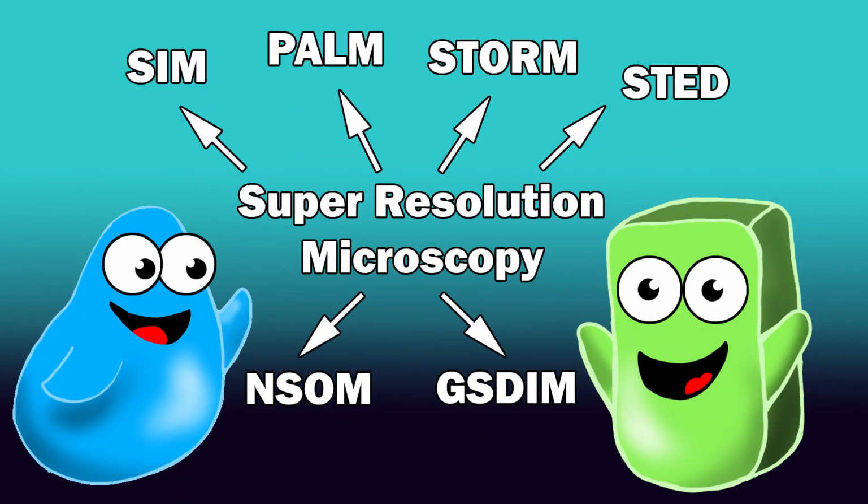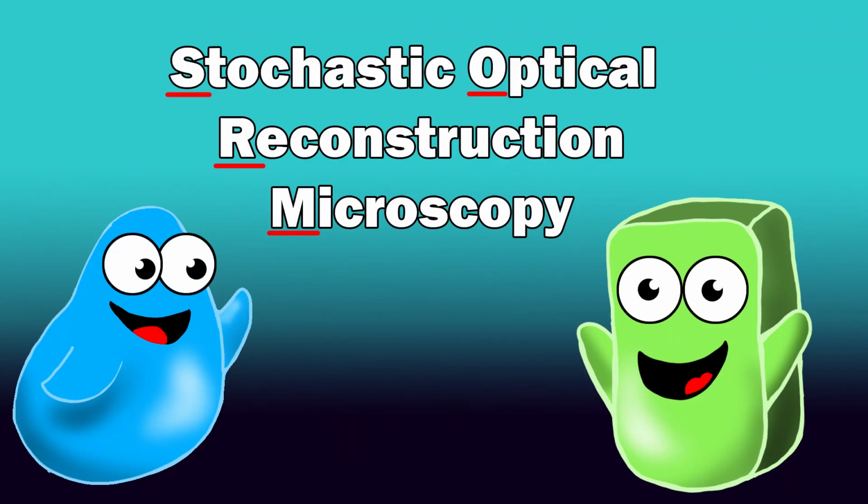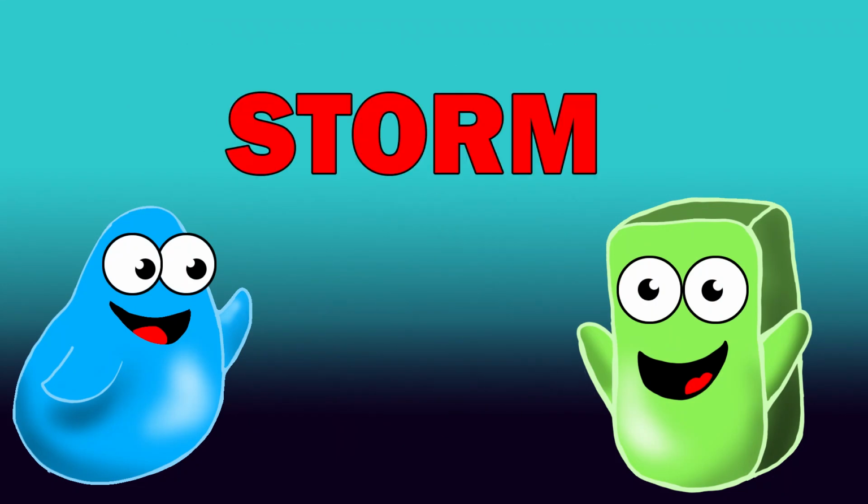SIM is just one of the many different super resolution techniques. There are other techniques that can get even higher resolution images than structured illumination microscopy. One of these techniques is called stochastic optical reconstruction microscopy, or STORM for short.